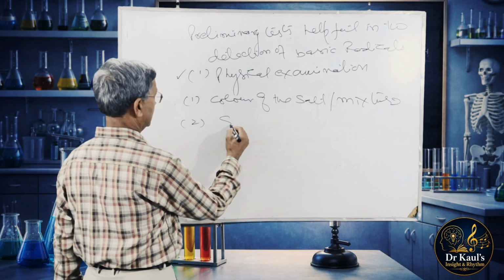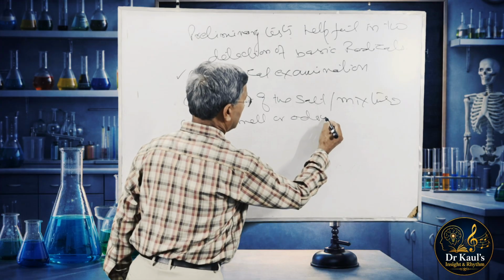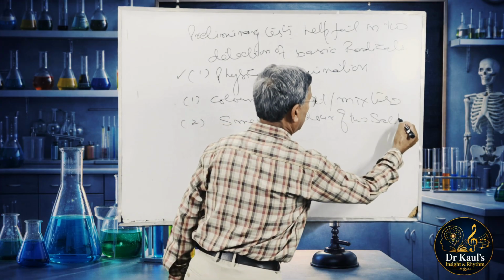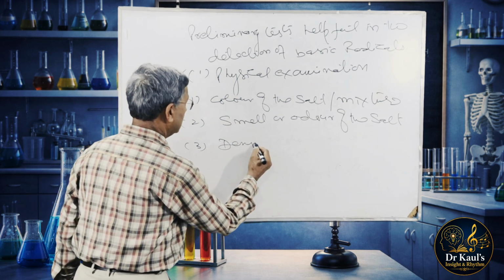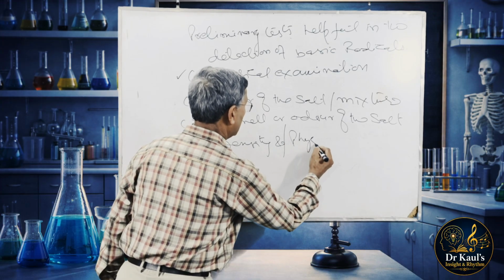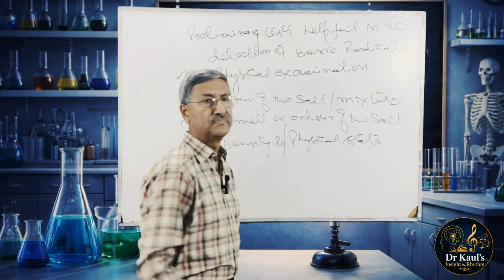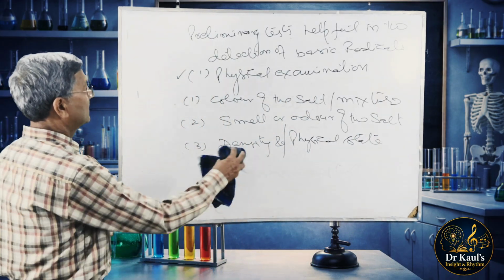Second is smell or odor of the salt. And third is density and or physical state. So first of all, we start with color of the salt.